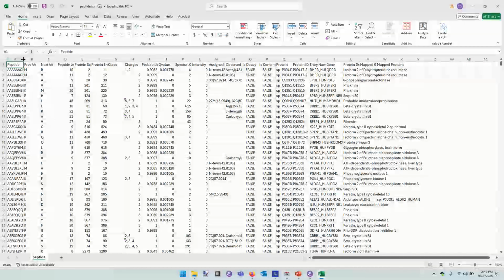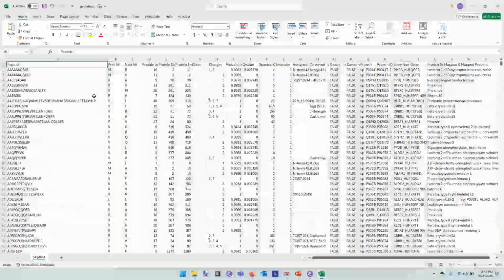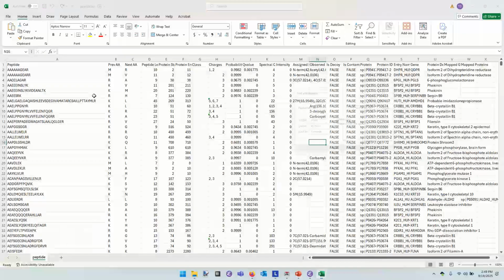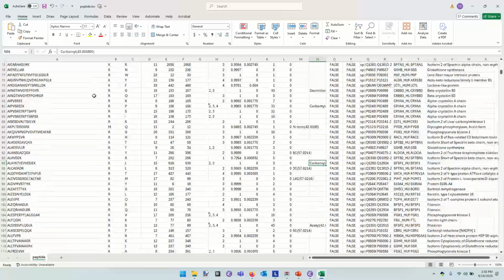All right. Now we are looking at peptides. Does this show the modifications within the peptides? I don't think it does. This is not showing modifications to the peptides, I think. Oh, here it is over here. Assigned and observed. Very good. Okay, so acetyl. In the other table, those were called unannotated. So let's see if I can do a quick search for unannotated. Helpful. Okay. If I just skip down here.